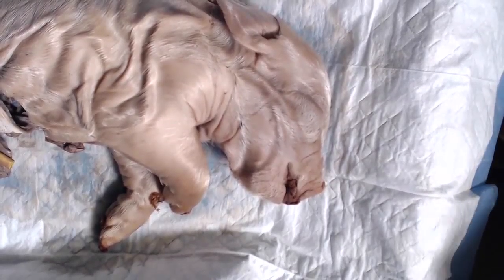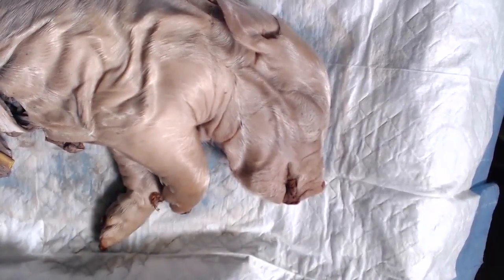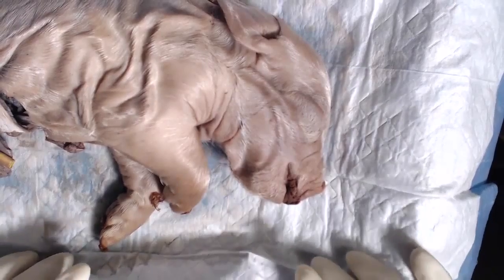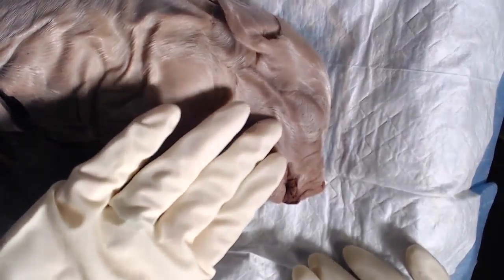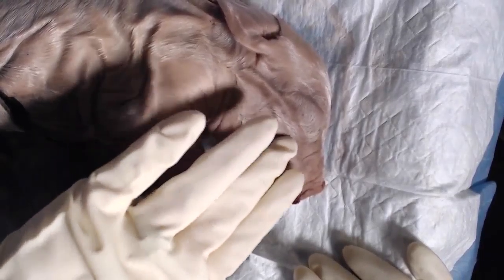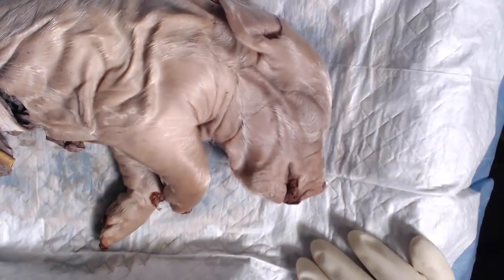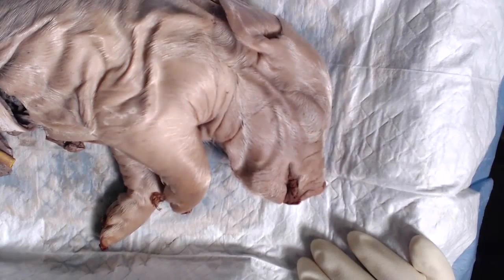First, you should have your pig already, and I just want you to have your pig laying on its side like this in my view here. The first thing I want you to do is palpate the pig's cheek so you can feel the masseter muscle. This is the area that we are going to be dissecting first. It's a really large round muscle, so you should be able to feel it pretty easily through the skin.